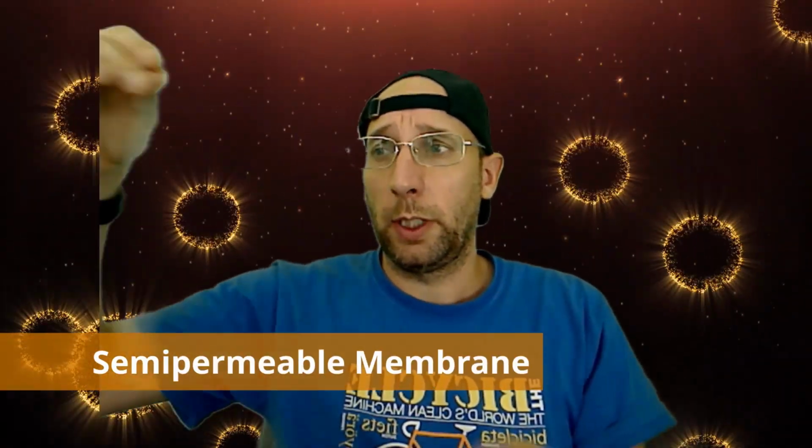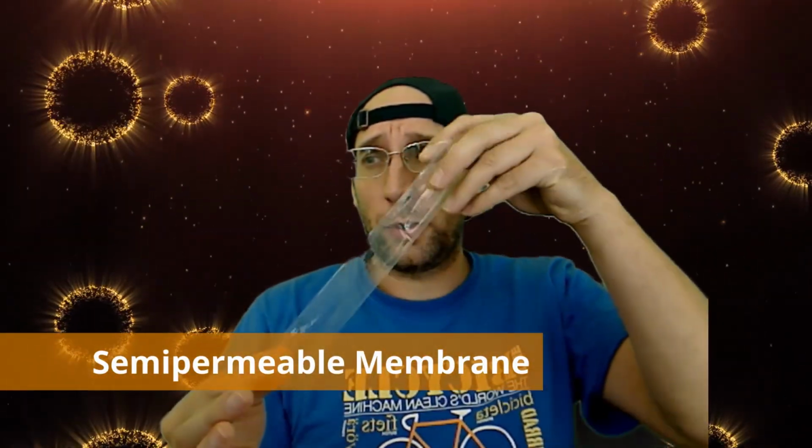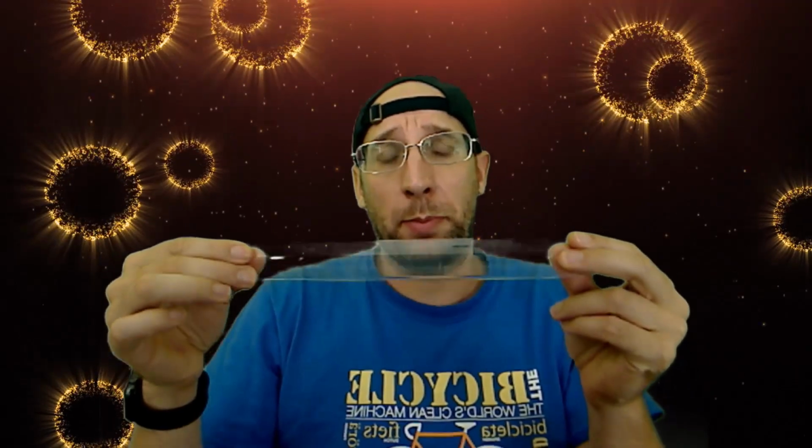Okay, let's get started. The first activity that we're going to look at, we're going to use this tubing here. It's called dialysis tubing, used for dialysis. It is a cellulose membrane. So as a cellulose membrane, it has different properties than a cell membrane. We're going to see what's permeable through this cellulose membrane today. It actually looks at first when you buy it like a piece of tape. It actually comes in a roll, just like tape.